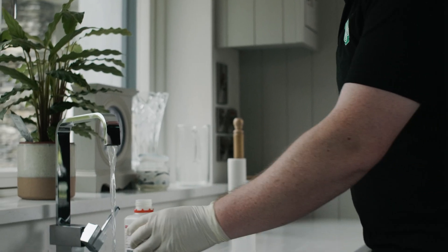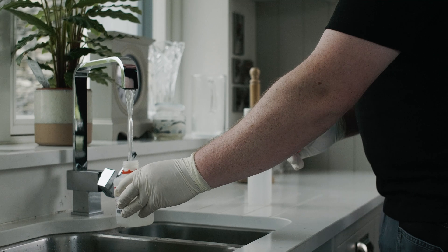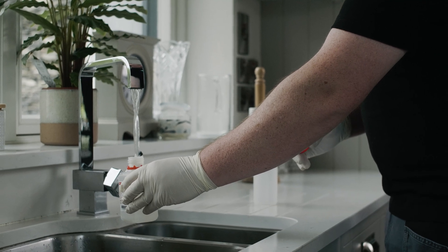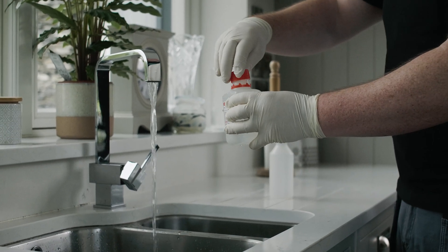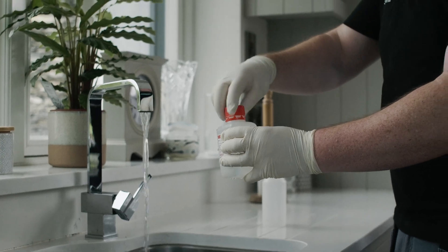Step 4. Place the sterile red cap bottle under the tap being careful not to touch the inside of the bottle or cap. Fill the bottle leaving a small air gap and replace cap securely.